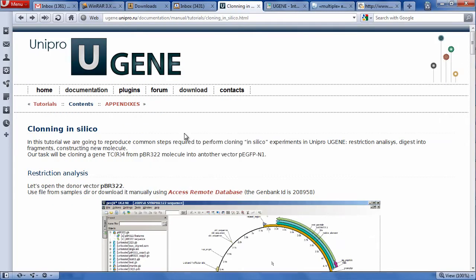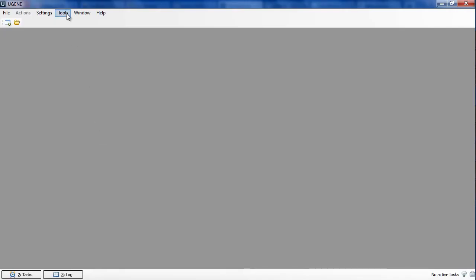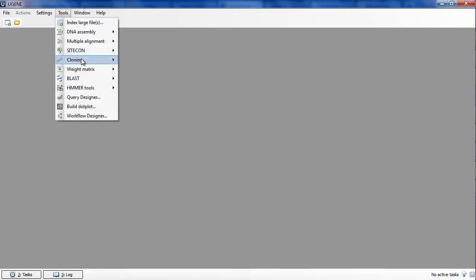Since UGENE version 1.9 we support some useful cloning in silico capabilities. After installing the latest package version, you are provided with automated fragment digestion and new molecule construction tools.